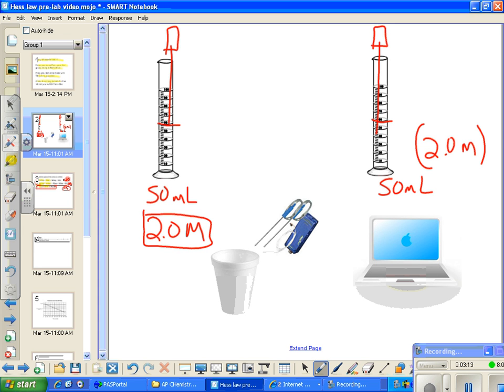You average the two because that's going to be your T initial. Because we're going to try and find delta T, which is what we need to find for the change in temperature to find Q using the heat equation. So the temperature initial is going to be an average of the two. They're not exactly going to be the same temperature. You would think they would be, but they're not.